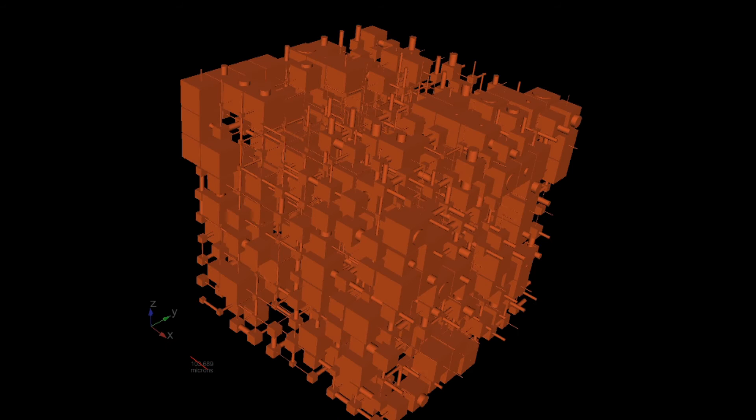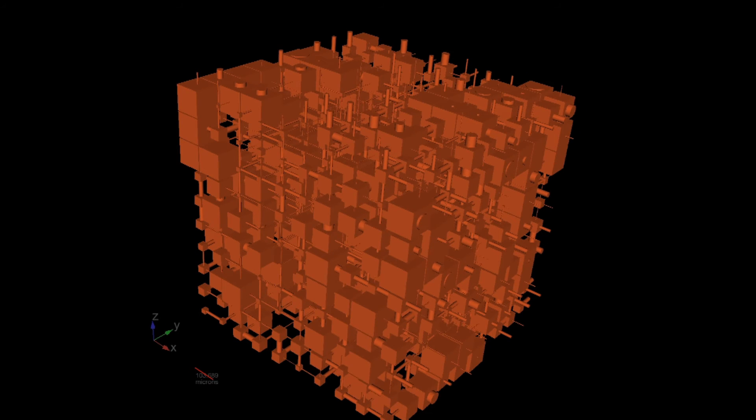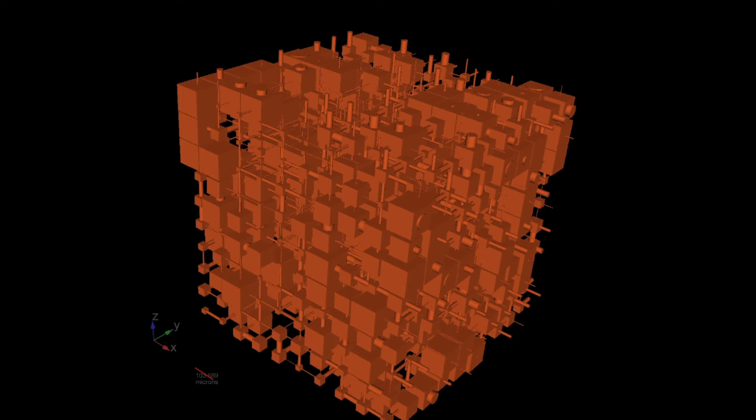So here we have a structure where the solid phase is shown as transparent. The holes within the structure are shown as boxes connected by cylinders. Now clearly that is very simplistic. A real sample doesn't look that simple.